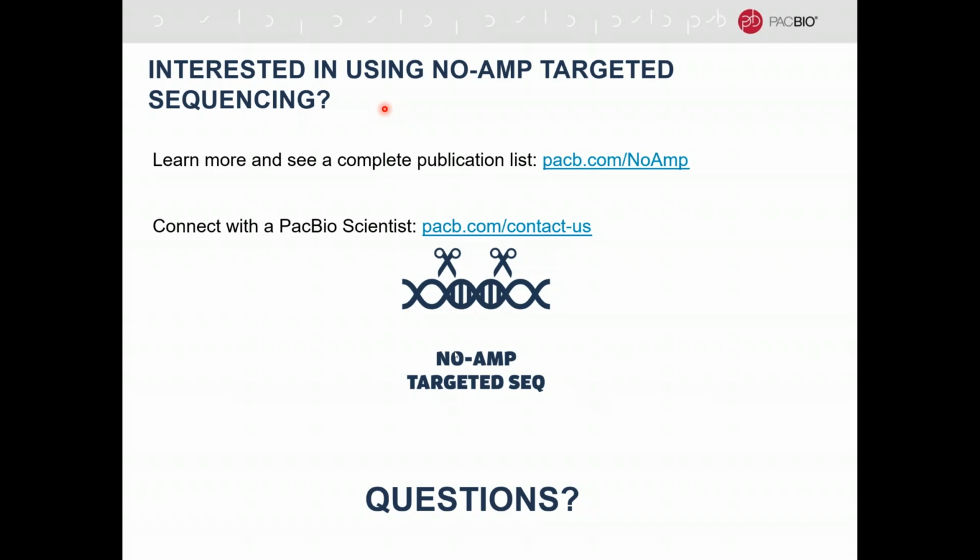Yeah. Generally, for each guide RNA, at least internally, we pick from the design tools that we offer. We have the reference guide, as I mentioned earlier, which goes through every step of this design process, and we usually recommend picking 3 guides for each locus you want to target, and then just picking the one that works the best. We have had very good results. As you saw, there's almost no background or off target at all.